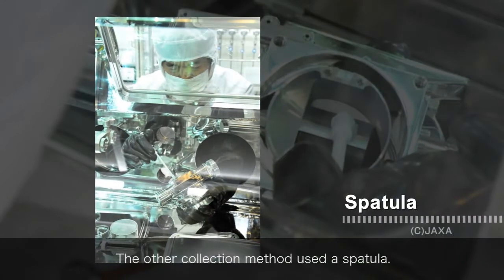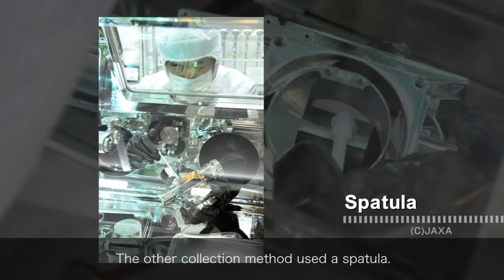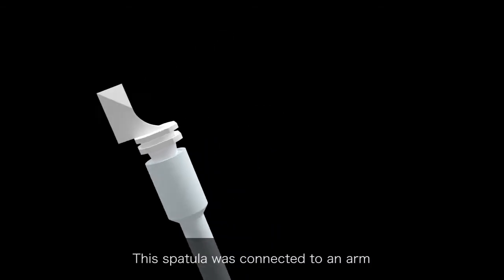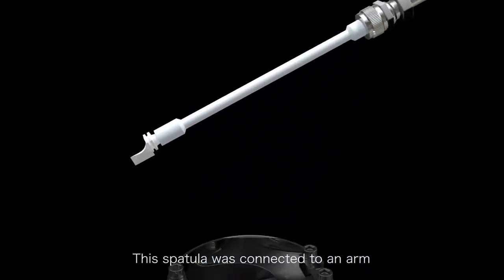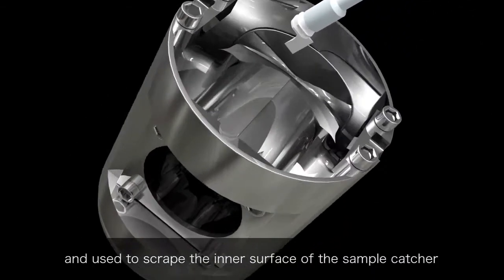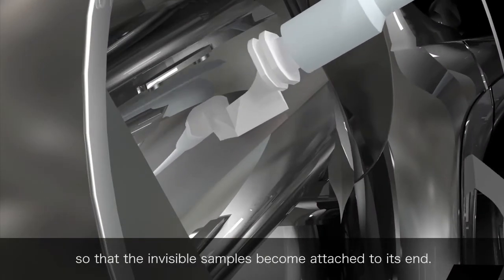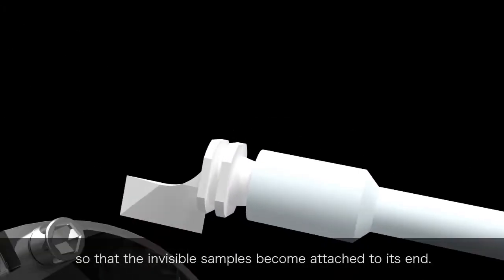The other collection method used a spatula. This spatula was connected to an arm and used to scrape the inner surface of the sample catcher so that the invisible samples became attached to its end.